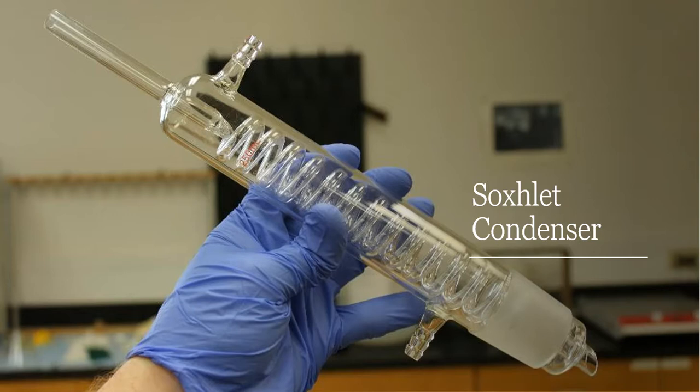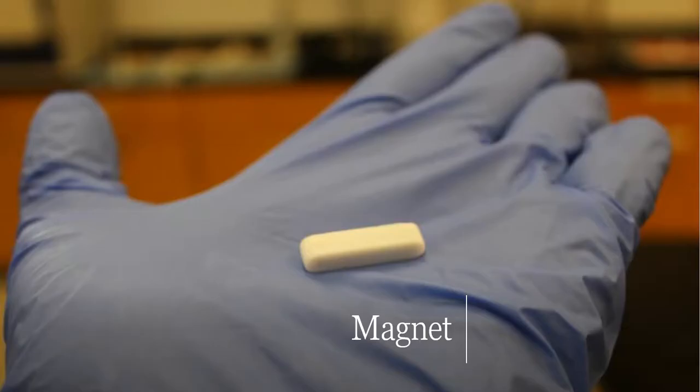I'm also going to constantly stir this material as well. This is going to have a very long extraction period. And I don't want anything to char. I don't want anything to burn. So because of that, I'm going to put a magnet in my boiling flask because we're better than little boiling chips. We invest the money into magnets to improve your education and give you the best possible around. So here's my little magnet that I'm going to put into the Florence flask.